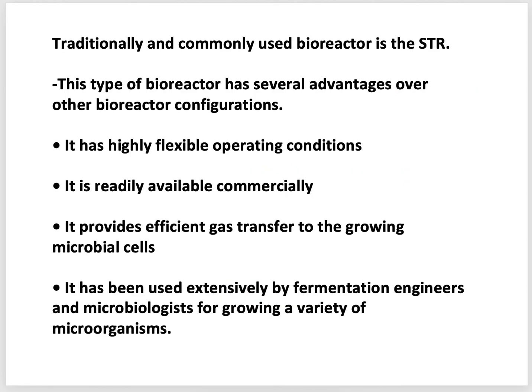However, we are done with the three types of bioreactors. Among these three types, traditionally, industrially, or commonly, the STR, the stirred tank type bioreactors, are most famous. They are most commonly or traditionally used. Why? Because this type of bioreactor has several advantages over other bioreactor configurations, that means other types of bioreactors.